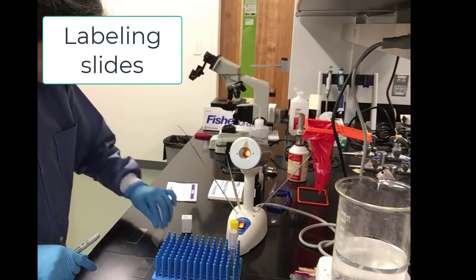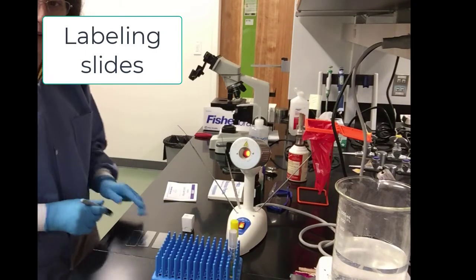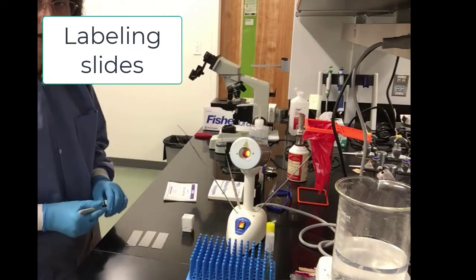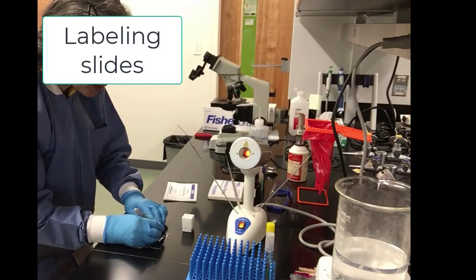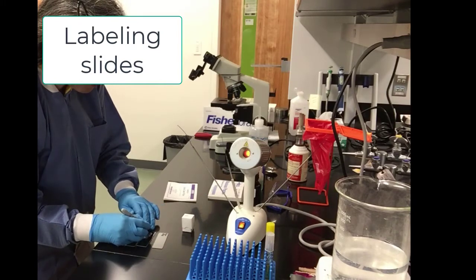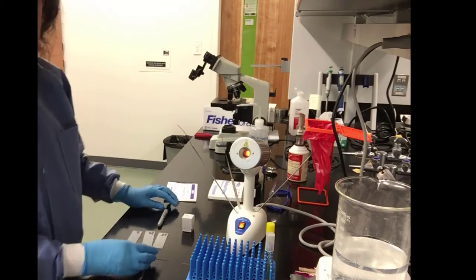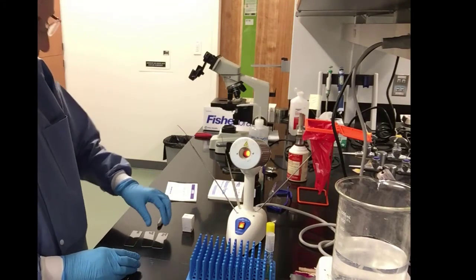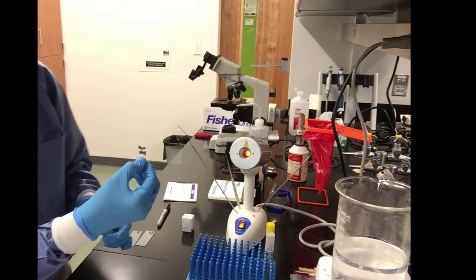So we will take them over here and we will start labeling them. We label with a permanent marker. So we will label the first one Mycobacterium smegmatis. Our next one Staph aureus, Staphylococcus aureus, and the next one will be a mix of the 2 bacteria. Now, one of these will be Acid-Fast positive and one will be Acid-Fast negative.